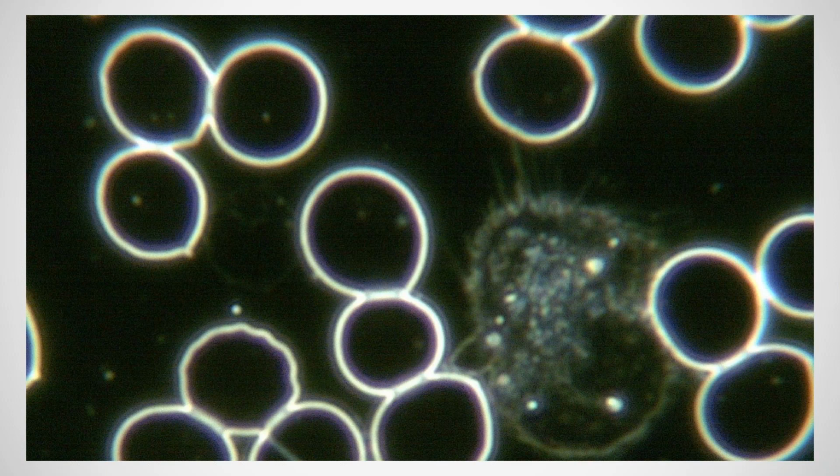All right, also with the 100 times objective here, so 4,000 times magnification on the screen. This is a monocyte, and we can see these dendritic growths, these extensions coming off the white blood cell here as well. So it's really nice to have this level of magnification, especially when looking at pleomorphic patterns and various growth forms. It's quite useful to be able to get up to this level of magnification, which at this point is really at the limit of what we're able to do with an optical microscope.